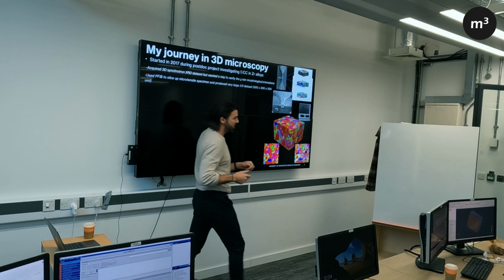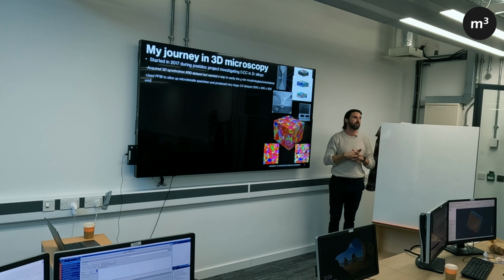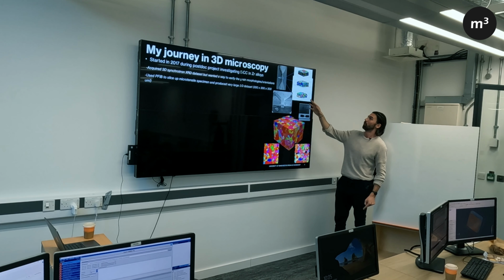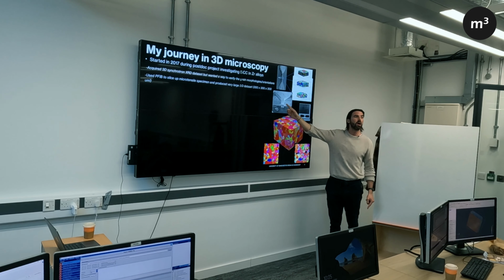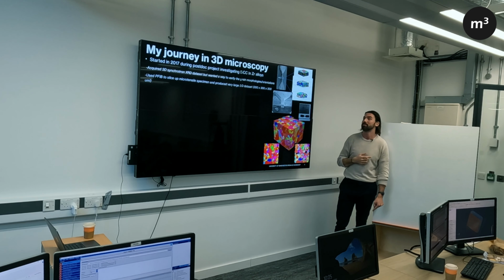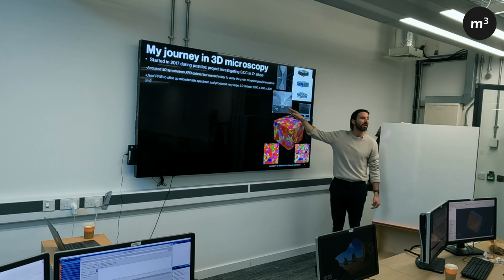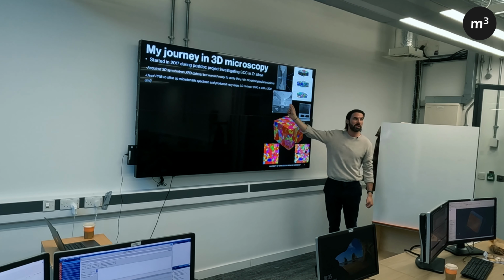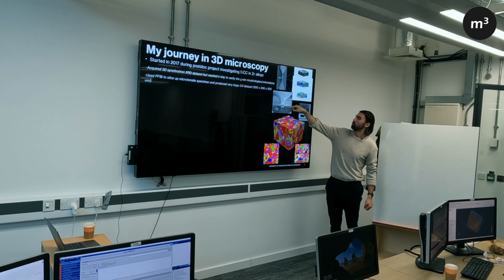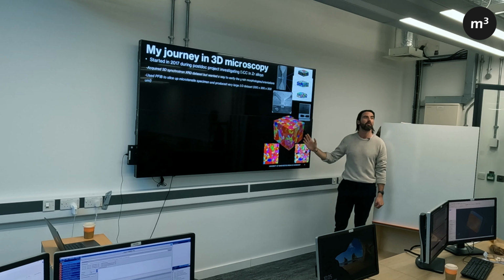I had all these grain shapes from DCT, and the problem with DCT is you don't get the whole grain shape, you have to do this dilation process. So in order to verify these grain shapes, we sliced up this microtensile sample using the PFIB over in PSI. Serendipitously, this was the perfect size. This was the maximum dimension the PFIB can do, which is 300 by 300 microns, and this had already been EDM'd into a 300 by 300 micron gauge length. So this was the perfect material.